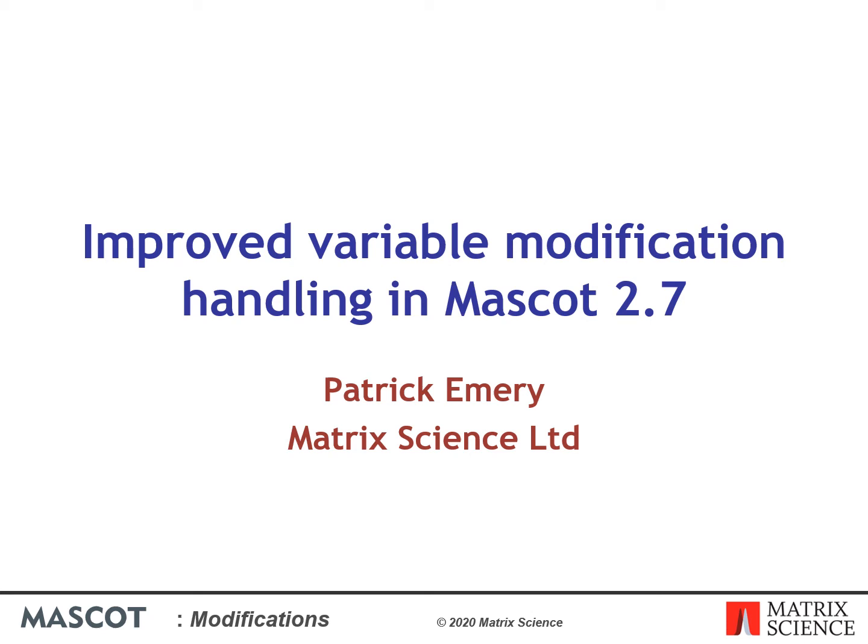Improved Variable Modification Handling in Mascot 2.7, presented by Patrick Emery from Matrix Science Limited.